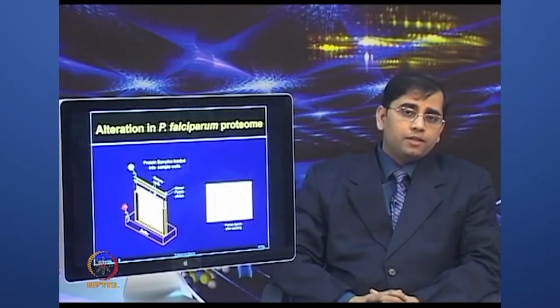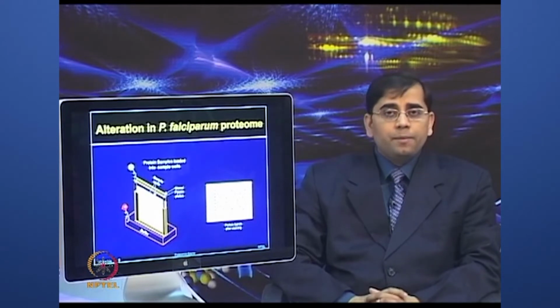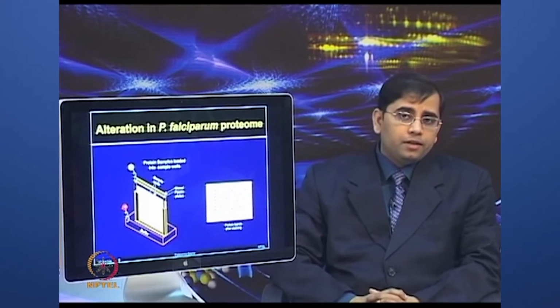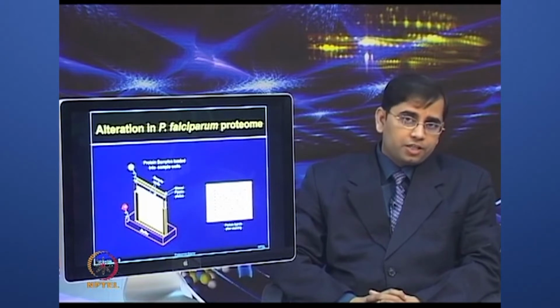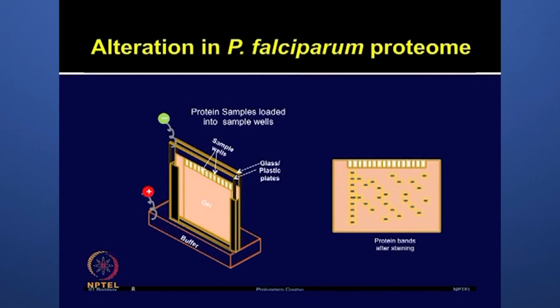Once protein extraction was done, then authors used IPG strip of pH 3 to 10 range for the first dimension separation of protein in the linear IPG strips. After the IEF was done, they equilibrated these IPG strips and then applied them on a 12.5% vertical SDS gel.